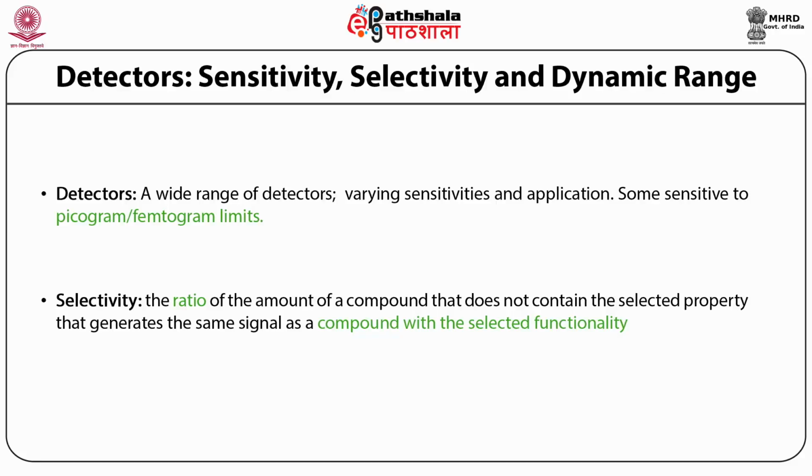Now, the detectors can be either mass sensitive, that is, they are responsive to the mass passing through the detector in a certain time, or they can be concentration sensitive, that is, they are sensitive to the concentration that is passing through the detector in a certain given time.